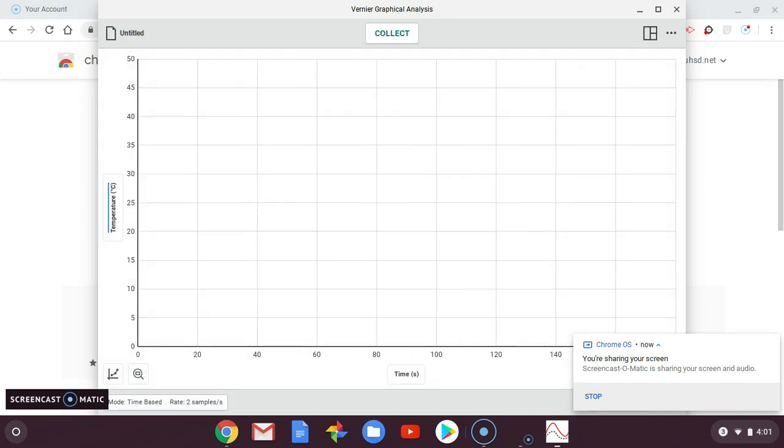On the y-axis, I should see temperature, time on the x-axis.